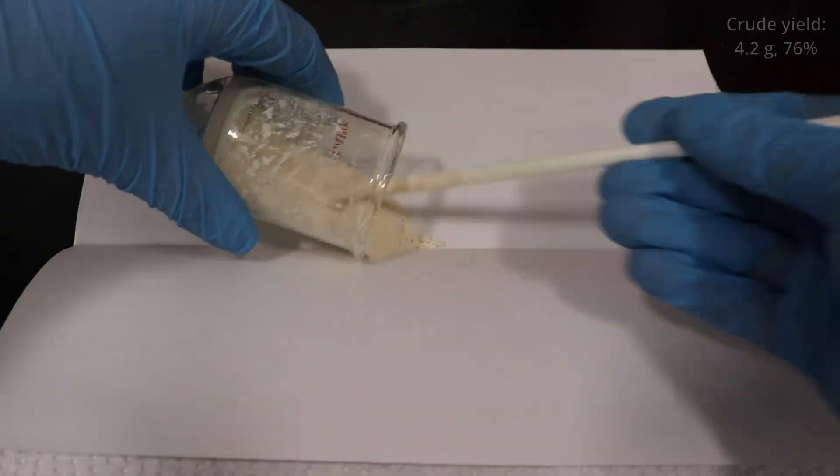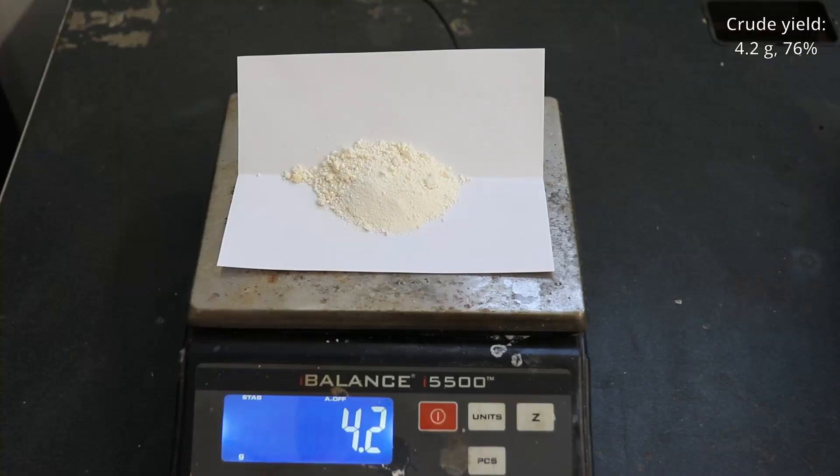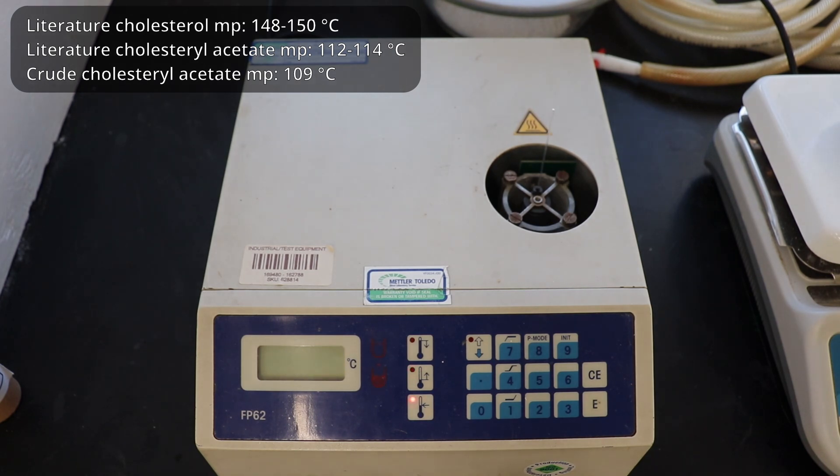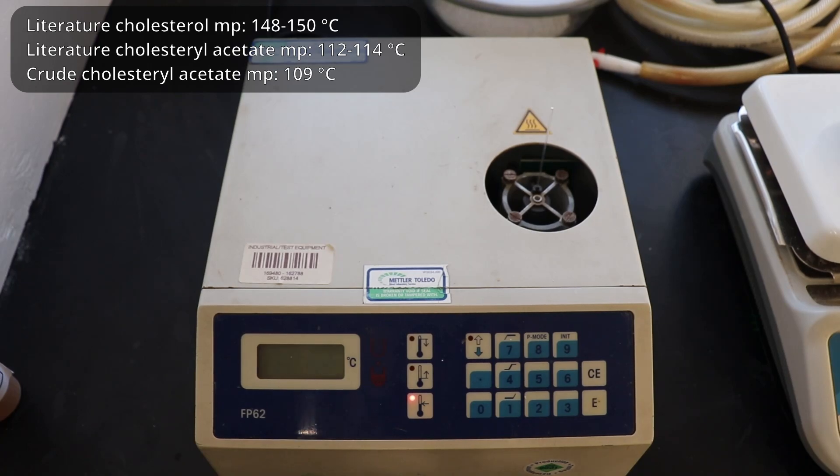The yield of crude material was 4.2 grams, which is 76%. However, the melting point was 109 degrees celsius, while the literature melting point is 112 to 114 degrees celsius, so this material was in need of a recrystallization.